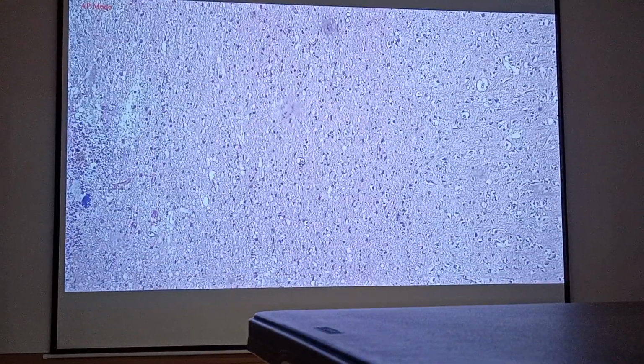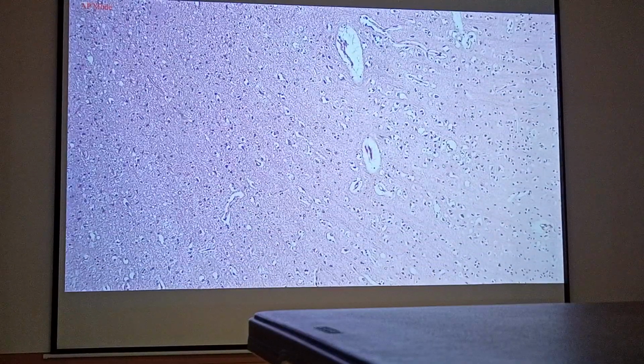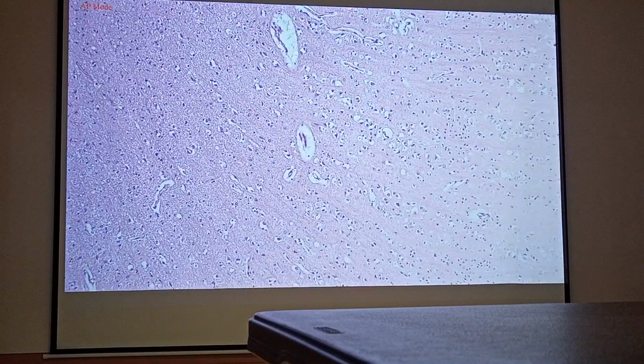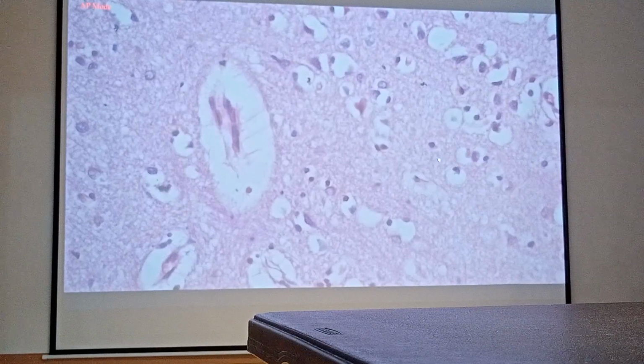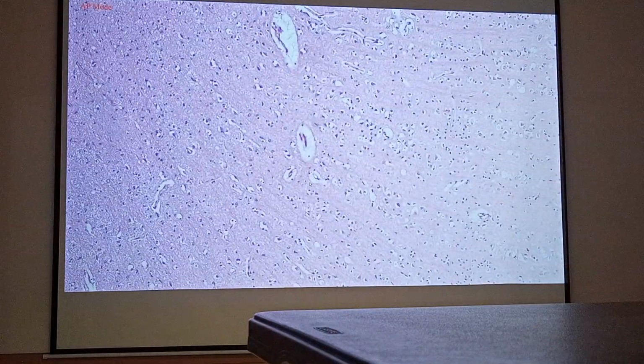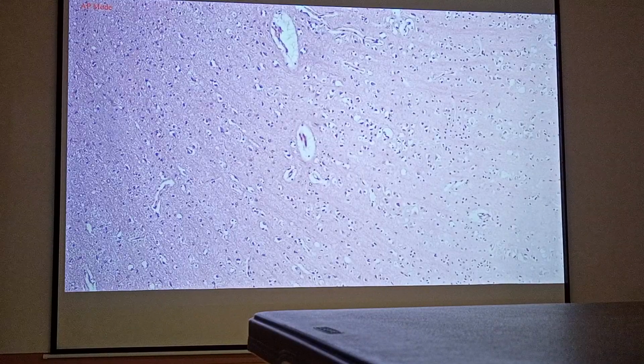And then, in this portion of the slide, we will be able to see the regular brain tissue. Name the cell pointed. Pyramidal. Pyramidal cell. This is actually the neuron or the brain cell. So pyramidal cells or the neurons accompanied by smaller cells, which are the glial cells or the neuroglial cells. Normal histology, normal cellular components of the brain, normal brain tissue.